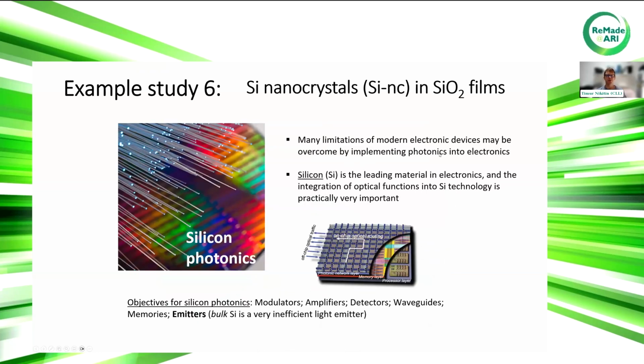So the last but not least is a study related to silicon nanocrystals, to nanomaterials. So it was silicon nanocrystals embedded in silica films. Many limitations of modern electronic devices could be overcome by implementing photonics into electronics. And since silicon is the leading material in electronics, the integration of optical functions into silicon technology would be practically very important and desirable.